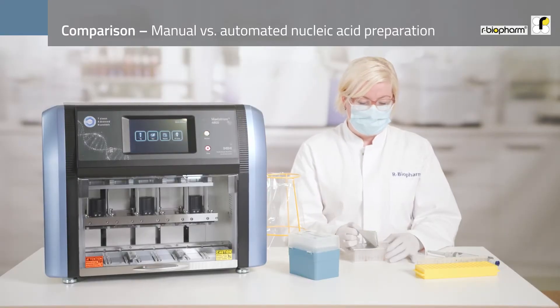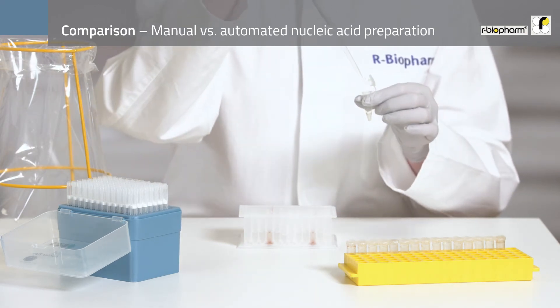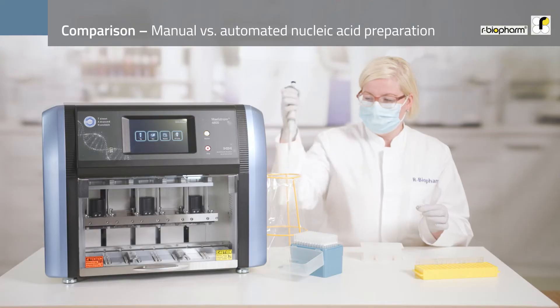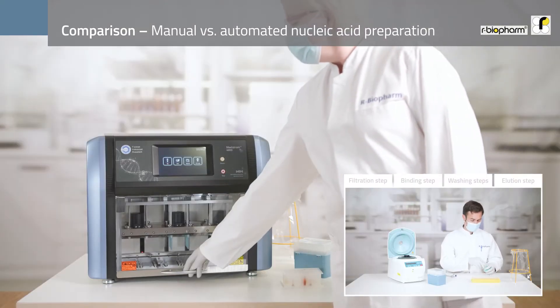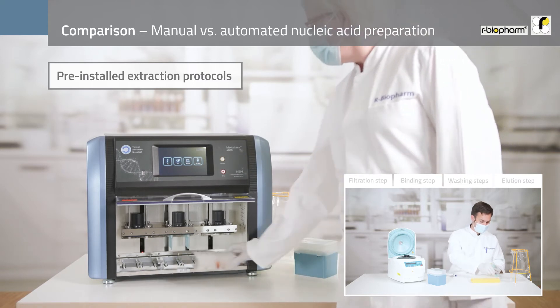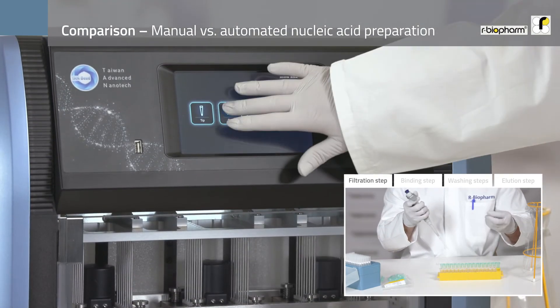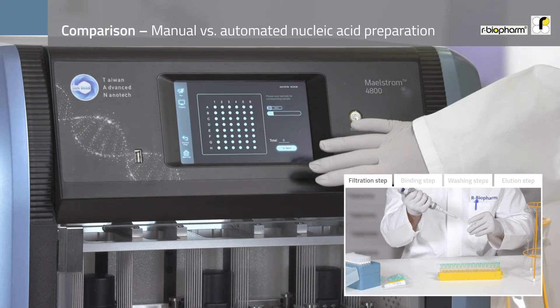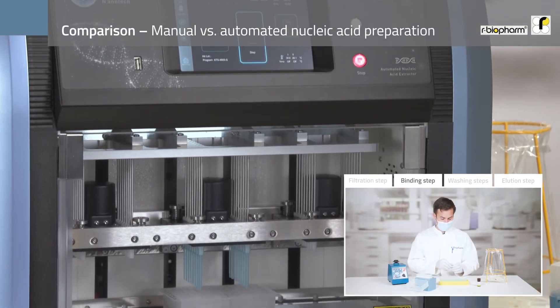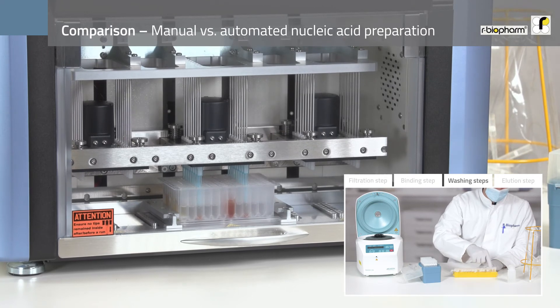Once you have the lysate, you simply transfer it onto the auto plate. Next, you start the automated purification process and walk away. So instead of carrying out a binding step and several washing steps as well as an elution step manually, you actually have time for other tasks.